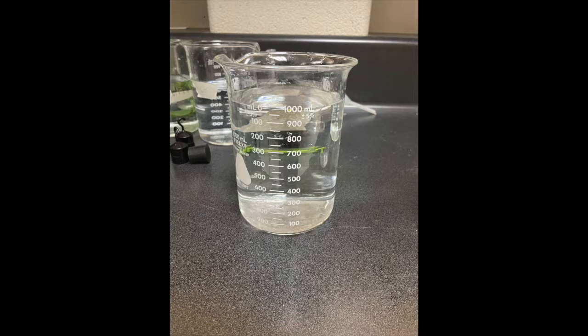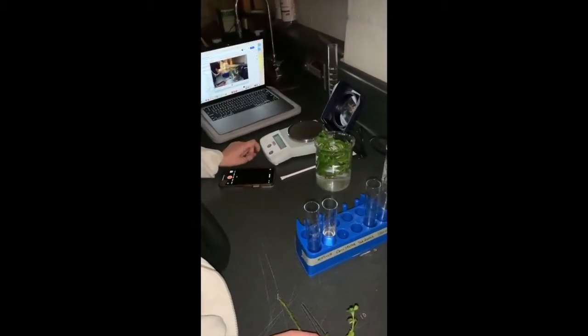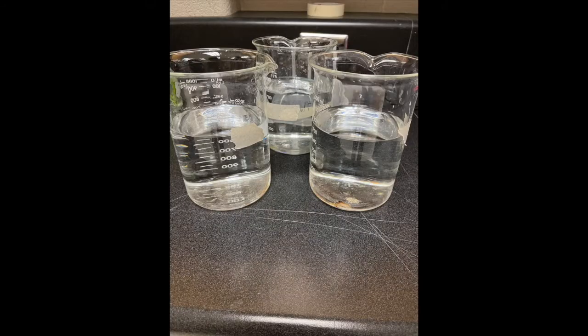We later measured out 3 grams of baking soda on a petri dish using an electronic balance and added it to one of the 1-liter beakers containing water. We repeated this process 2 more times so that 3 grams of baking soda had been added to all of the 1-liter beakers containing 1,000 ml of water, and stirred the solution until the baking soda had fully dissolved.